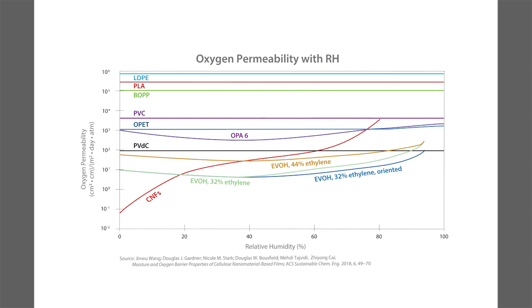It doesn't look as extreme here because this is a log scale, but in real life, it's a big deal. So when people incorporate things like EVOH or nylon into a nice pouch structure, or a coffee cup or capsule, they put those in there to keep, let's say, the coffee nice and fresh, a good oxygen barrier. But they may then protect it by putting these other layers around it to protect that layer from moisture and changing that OTR.